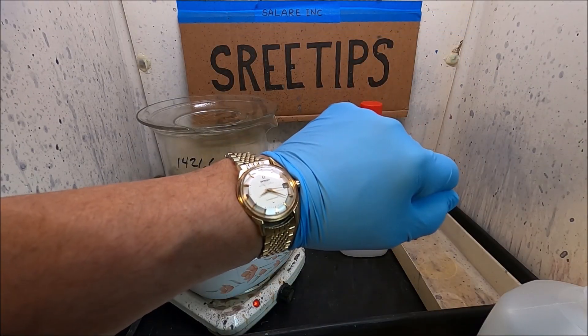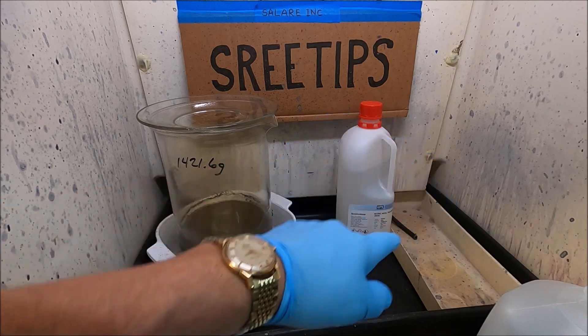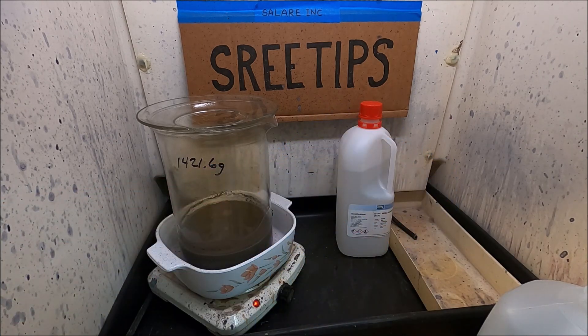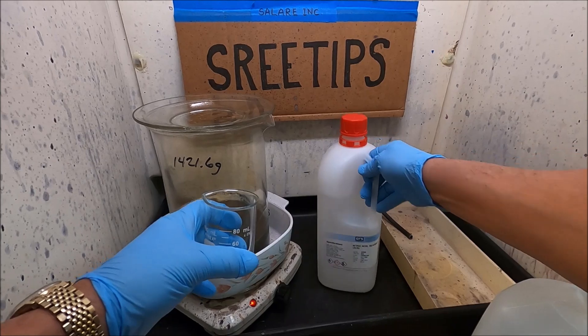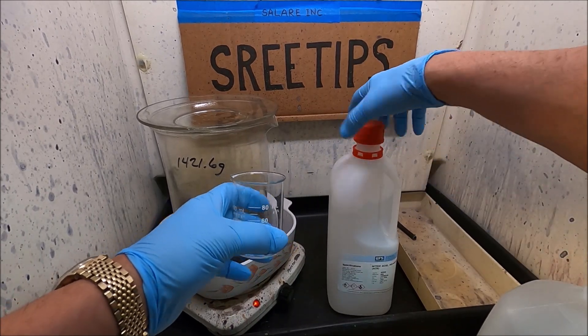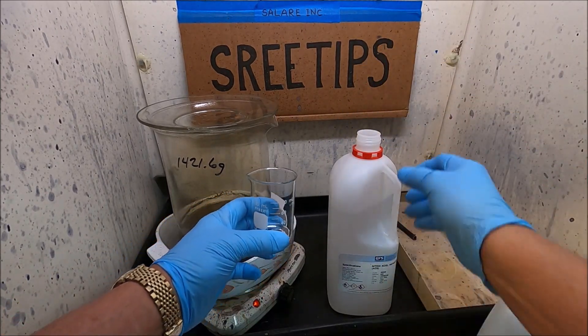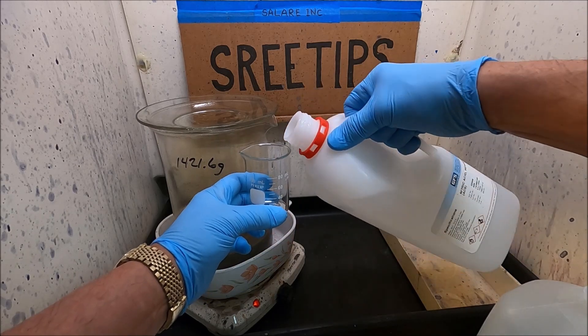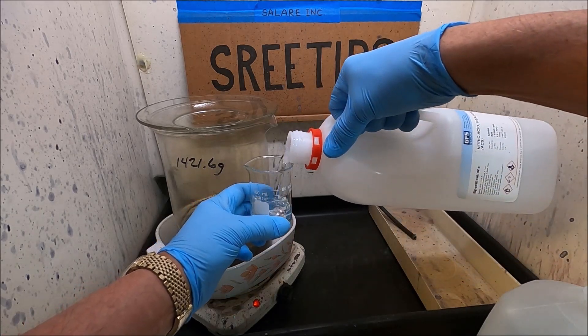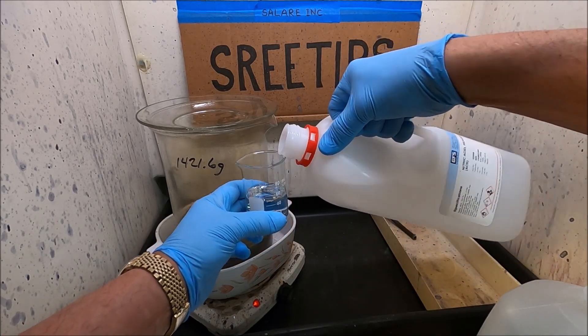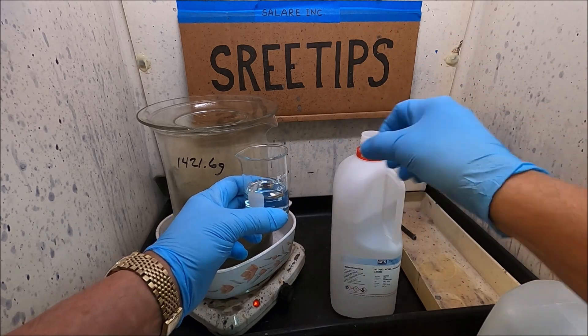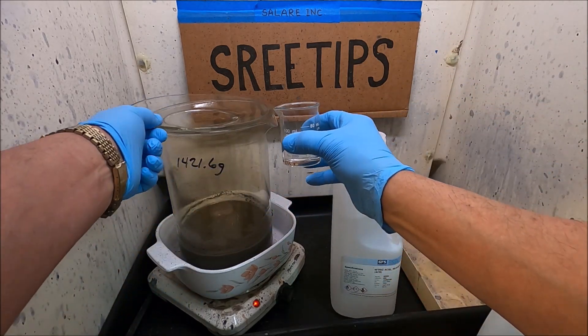The time is 8:20. We've been boiling with some dilute nitric for about 50 minutes. I'm going to add a little bit more nitric acid to it, about 50 milliliters here going in, and we'll let this stay on heat a little longer and see if we can extract some more stuff out of here.